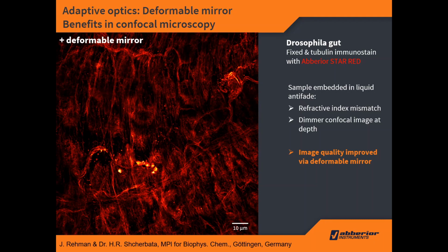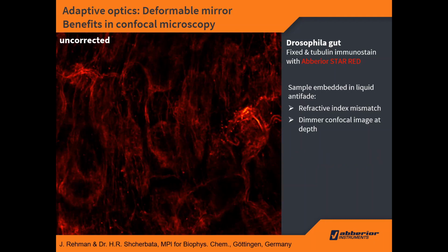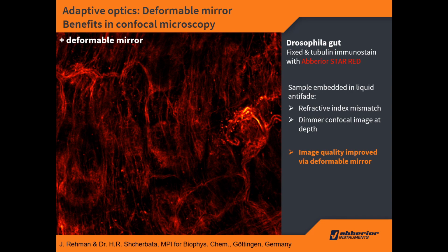sharper. Since the structures are fine, we zoom in a little bit and repeat this, and you can see the uncorrected image here, and switching on the deformable mirror, you can see an increase in brightness.